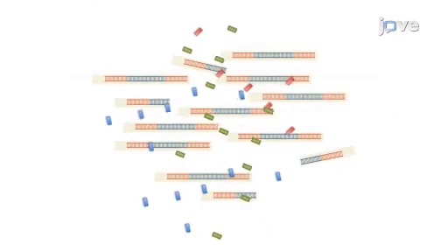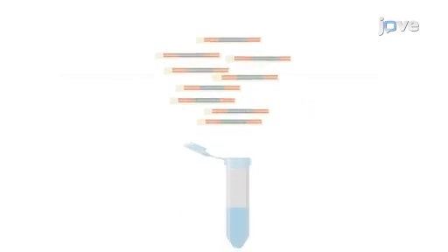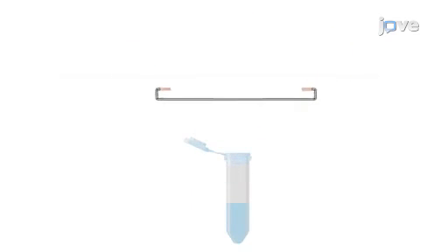Next, DNA templates for the assembly reaction are amplified by PCR. Next, a purification of the PCR products is performed. The final step is the assembly reaction, transformation of the resulting plasmids, and plasmid clone verification.